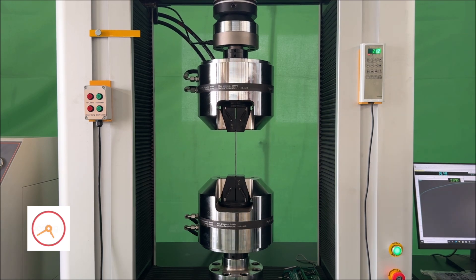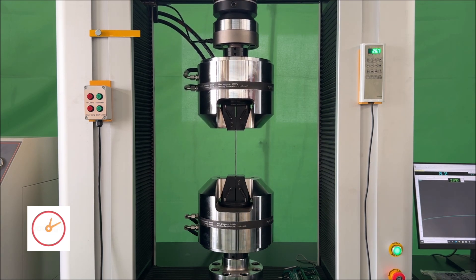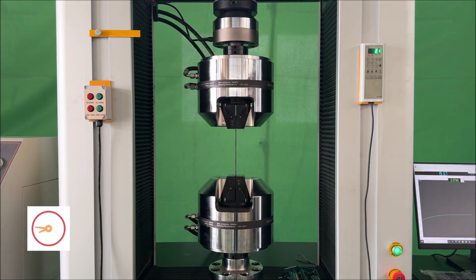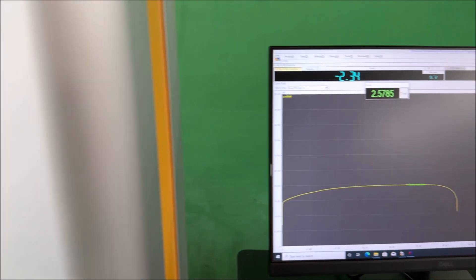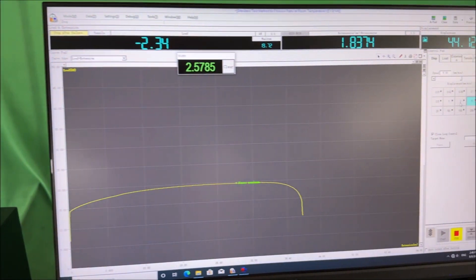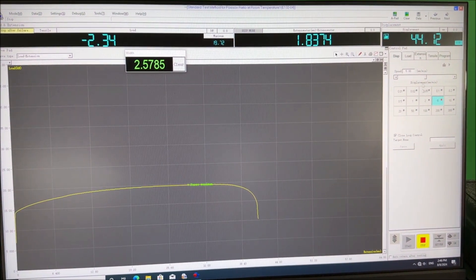Wait for the test to finish. Once completed, you can obtain an accurate data report.